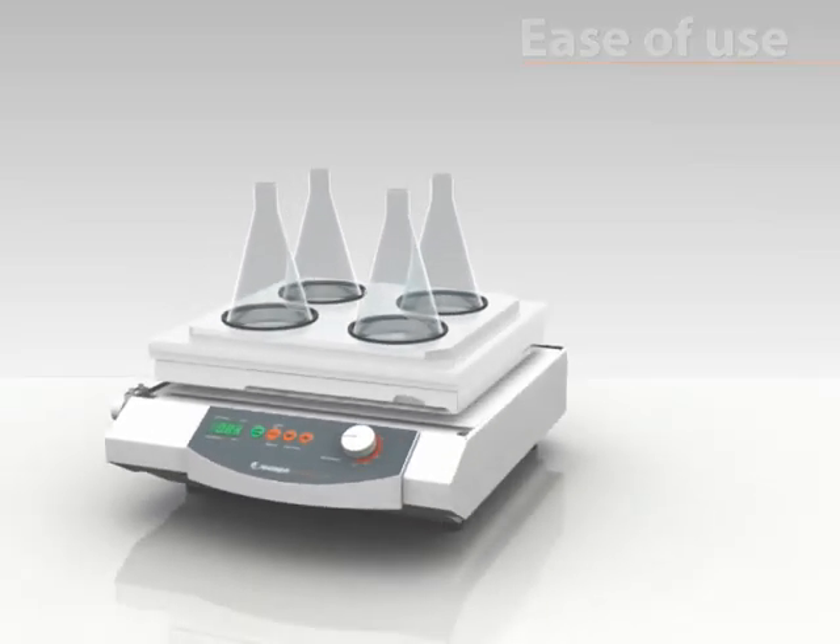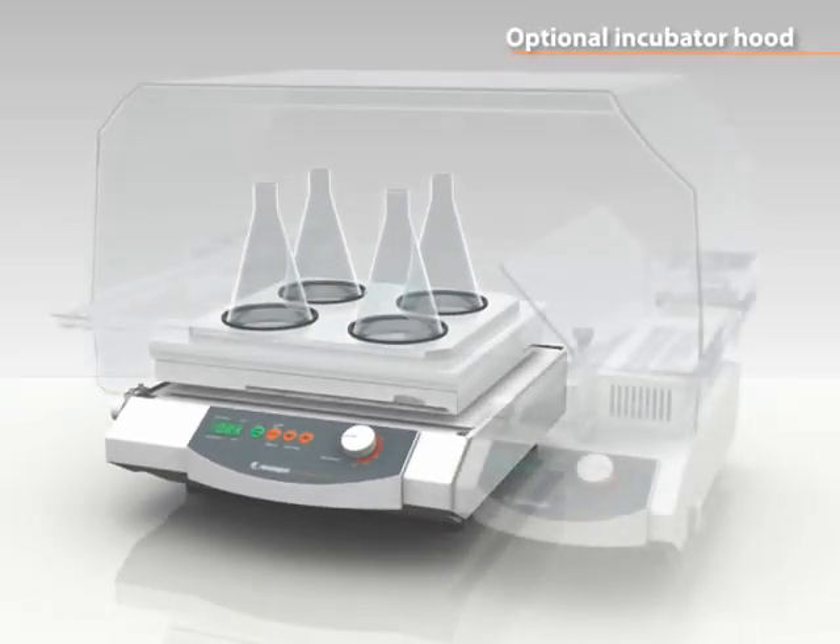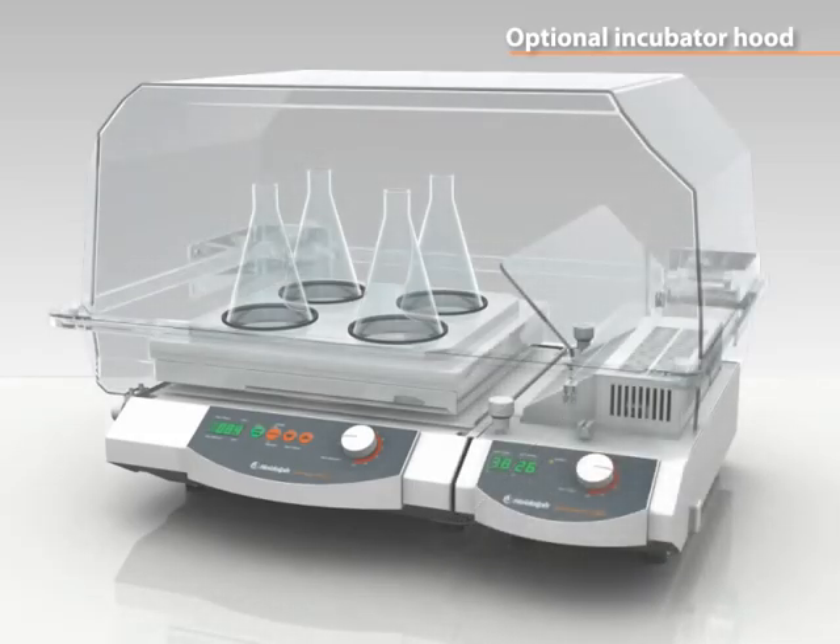The platform shakers are suitable for the optional incubator system and are recommended for applications which require variable temperature control.